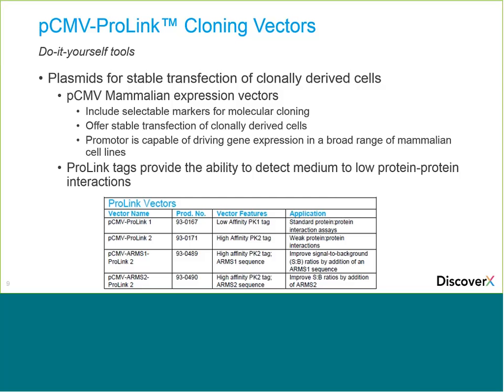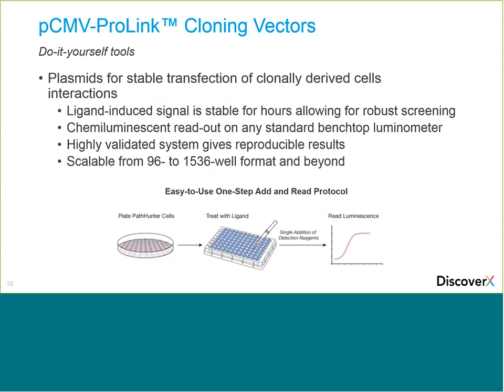The first one we'll go over is investigating beta-arrestin recruitment, looking at tissue-specific variations. Knowing that protein expression is definitely modulated by developmental, environmental, or even pathological factors, pathologies such as metabolic diseases, for instance. So you're going to use your cell line to study these differences in different cell backgrounds.